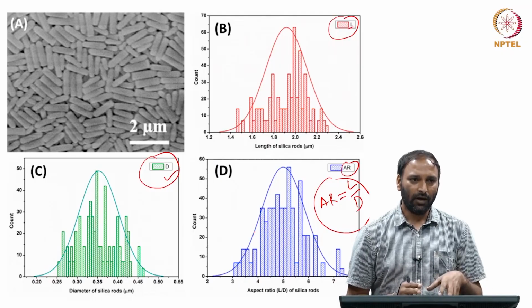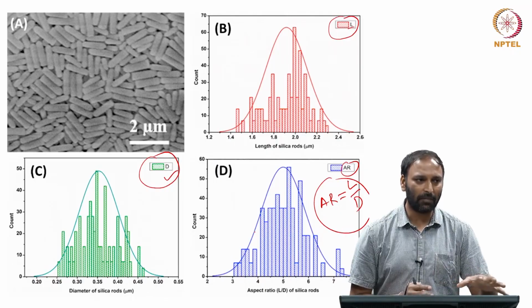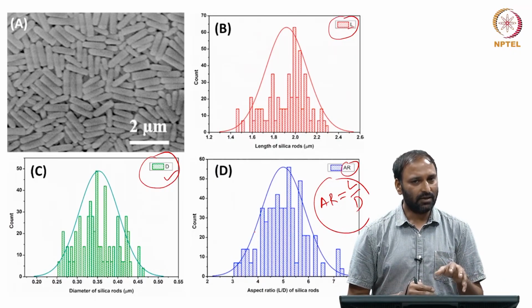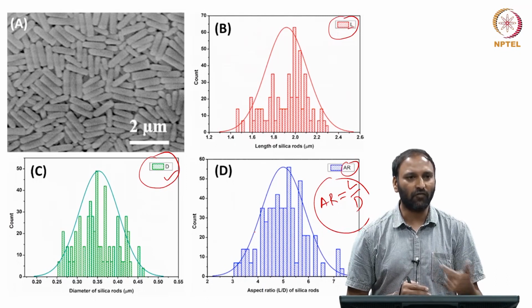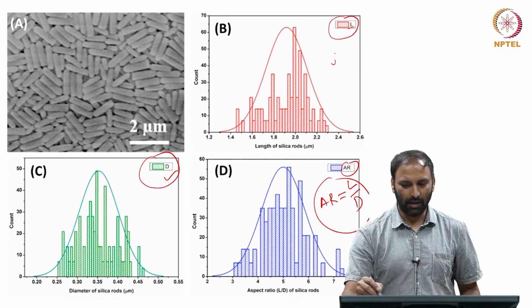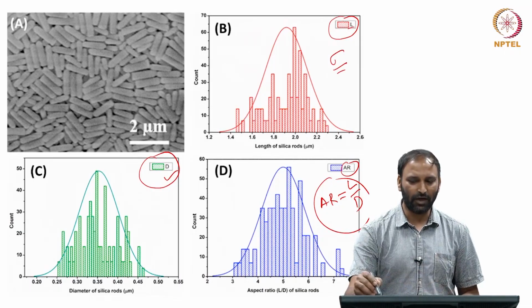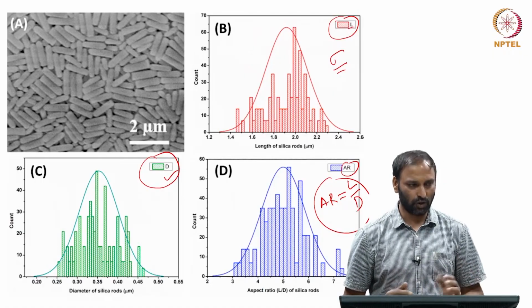Okay. So, I can use a similar principle to what I used for analyzing spherical particles, like getting the size distribution, fitting the distribution to a known function like Gaussian distribution or log normal distribution, and then extracting the average size and the sigma. Okay. I can do a similar thing for each of the physical dimensions for non-spherical particles. Okay. That is what you typically do.